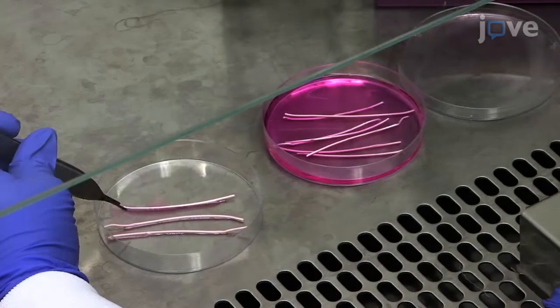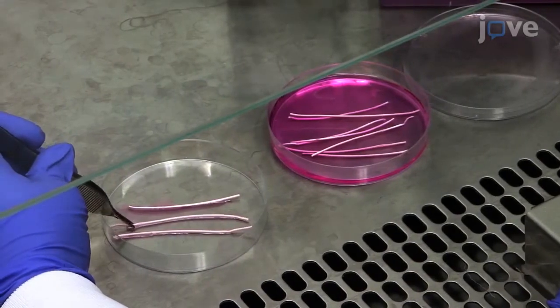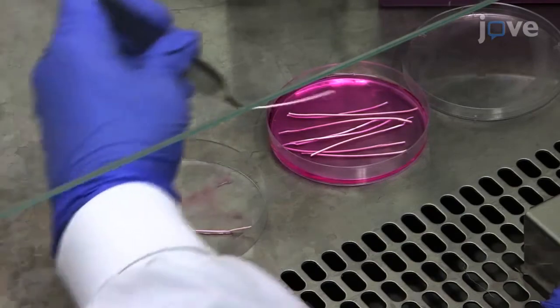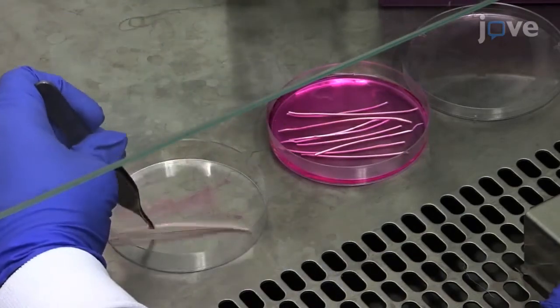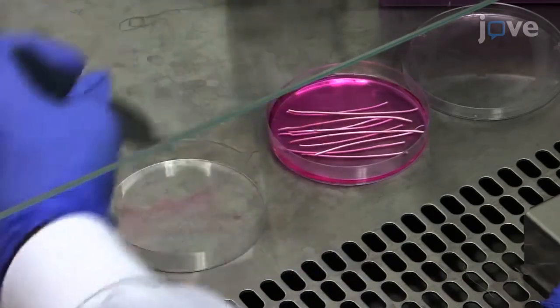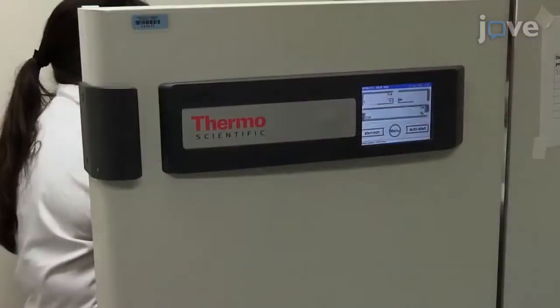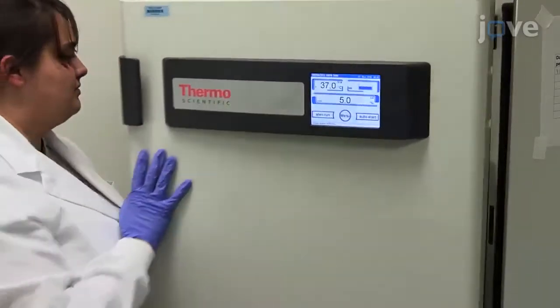After 5 minutes, transfer the fibers from the incubator into a new 6-centimeter petri dish containing fibroblast culture medium supplemented with L-ascorbic acid, L-ascorbic acid 2-phosphate, and transforming growth factor beta 1 for up to 3 weeks in the cell culture incubator.